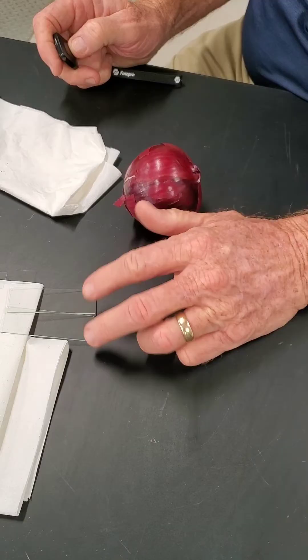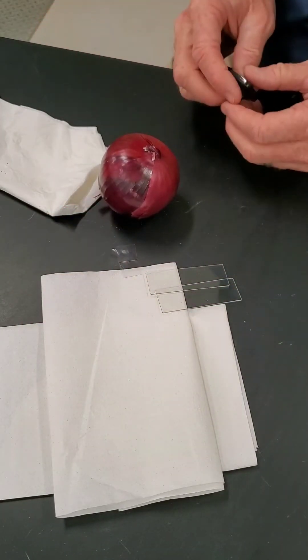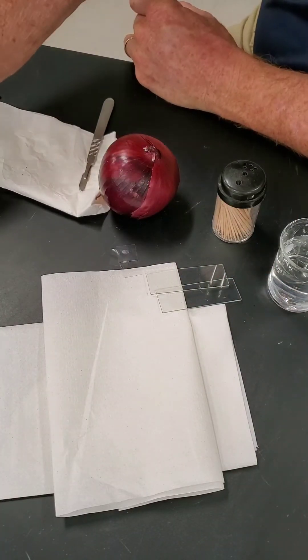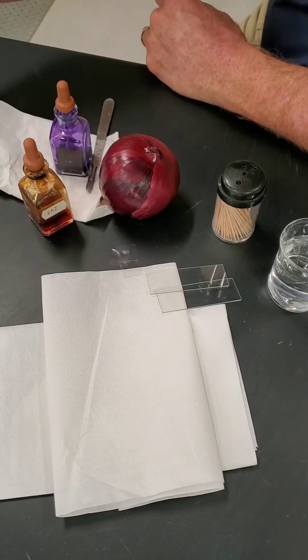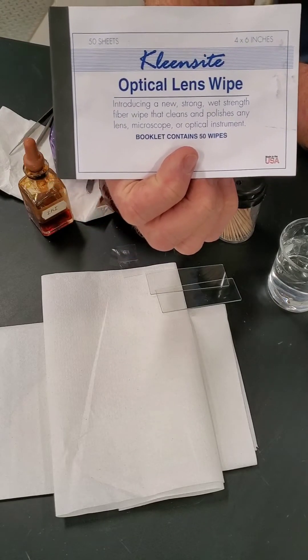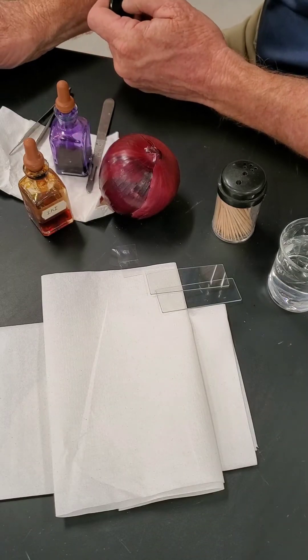We've got our onion, a couple of slides, some cover slips that I pre-cleaned, a little beaker of water, toothpicks, a little scalpel, methylene blue and iodine for staining, a pair of forceps just in case, and our trusty lens paper to clean our microscope, which needs to be really clean for this lab.